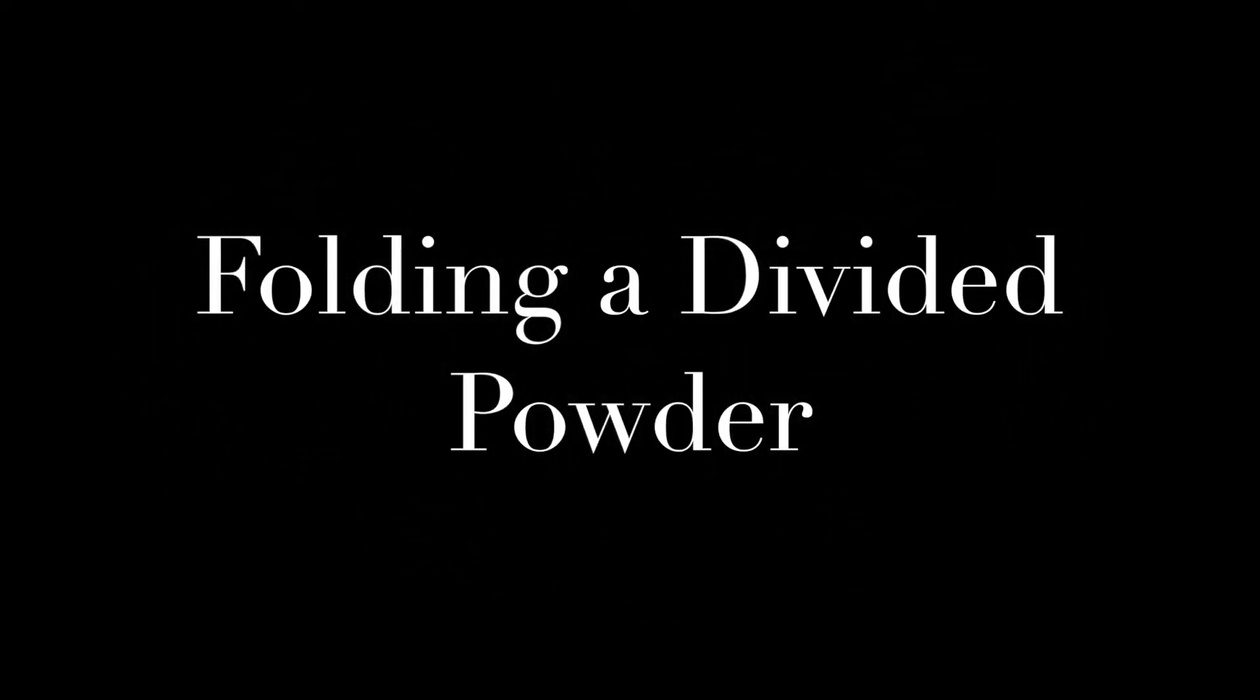We are now going to show you how to fold a divided powder. The preparation is going to be identical to when you are making capsules. The only difference is that you are going to be filling a divided powder rather than an empty capsule.